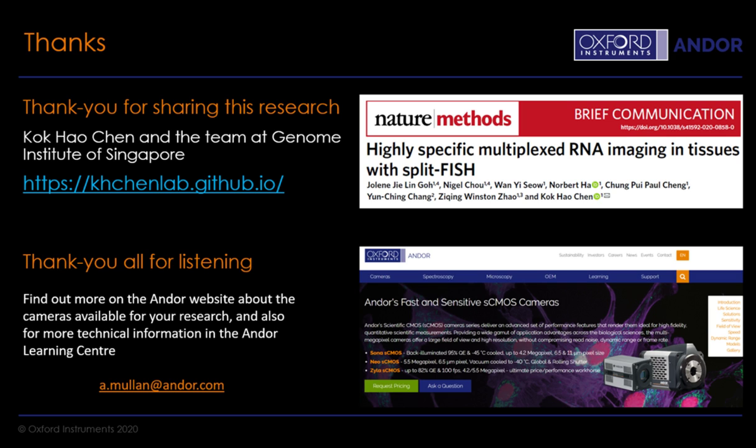But in theory, the multiplex FISH approach has already been shown by others to image the whole transcriptome. I think that is very exciting because it allows this unbiased approach for us to answer any kind of phenotype genetics question that people have.